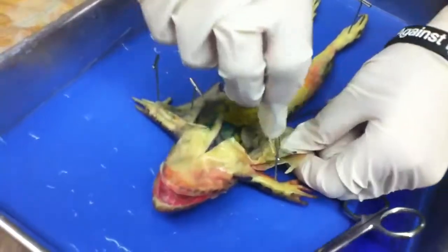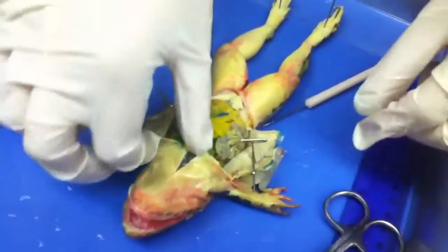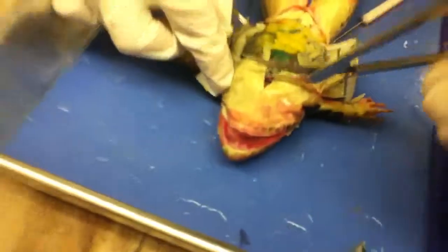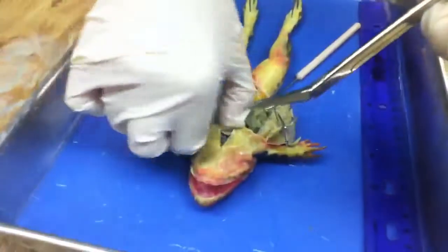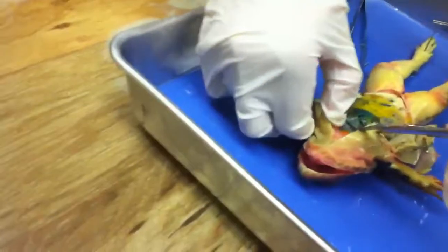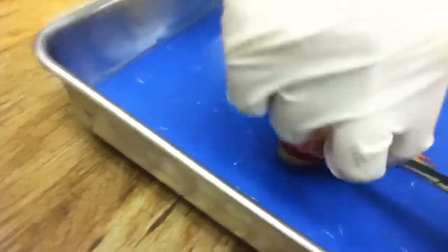Alright, our next instruction. Lift and cut through the muscles and breastbone to open the body cavity. You did that, right? If your frog is a female, then the abdominal cavity may be filled with dark colored eggs. So remove the eggs on the one side so you can see the organs beneath them. Is there dark colored eggs? I can't tell.